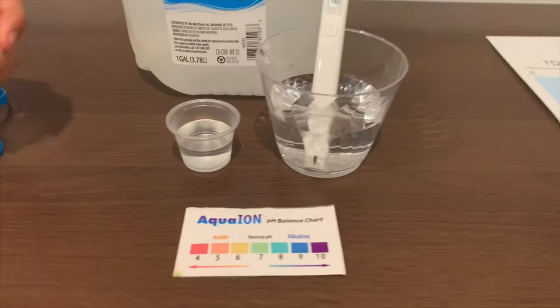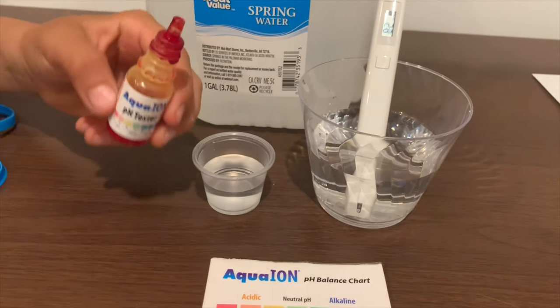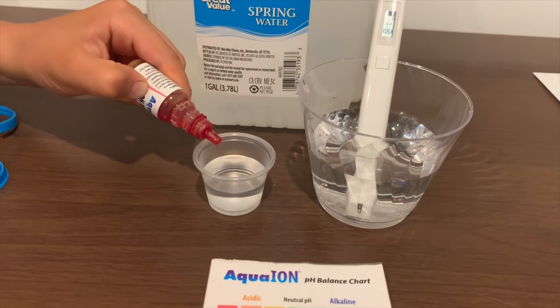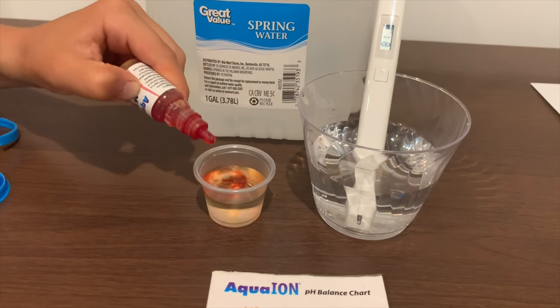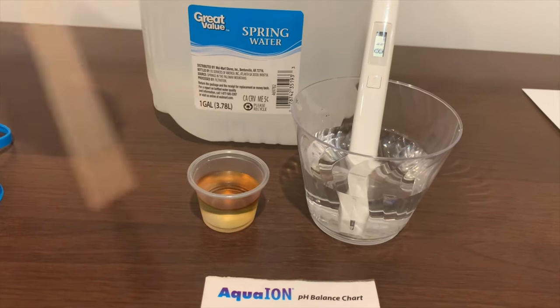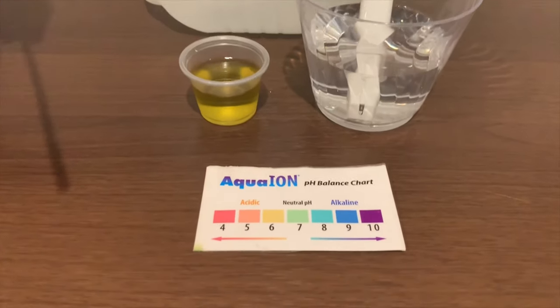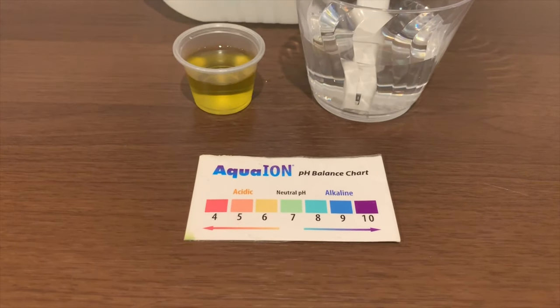Now let's test the pH level. If you want to buy this pH tester, check the link down below. Only do two drops — my bad, I accidentally did three. Let's stir it a little to get a better result. This gives a 7, which is a neutral pH.